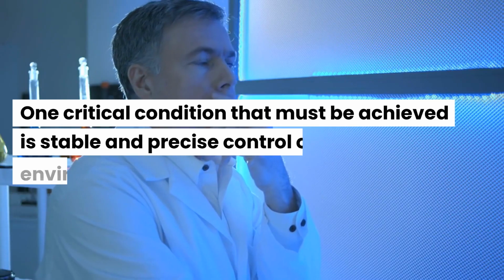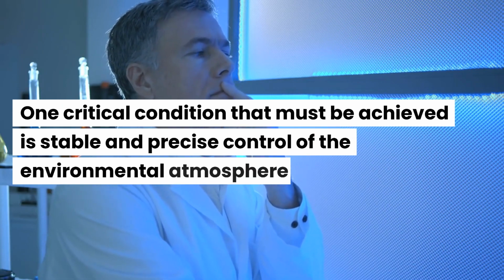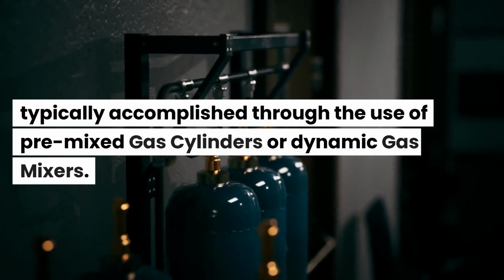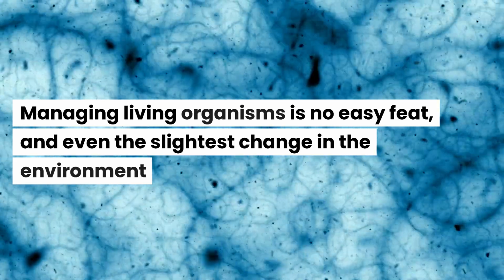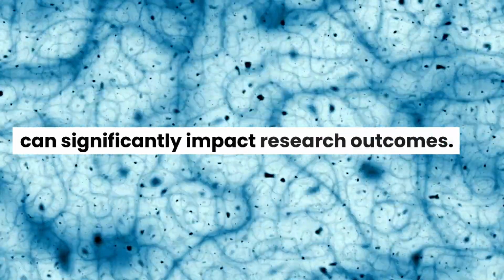One critical condition that must be achieved is stable and precise control of the environmental atmosphere, typically accomplished through the use of premixed gas cylinders or dynamic gas mixers. Managing living organisms is no easy feat, and even the slightest change in the environment can significantly impact research outcomes.